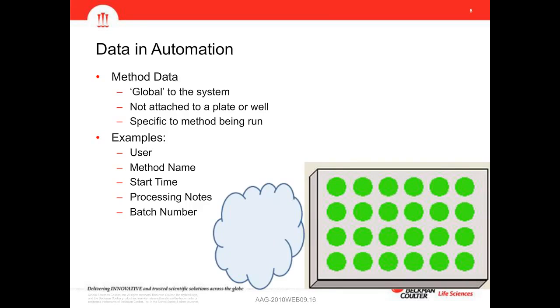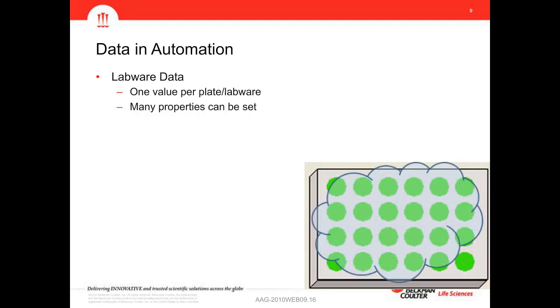And although this particular screen only had 12 total plates, you can imagine a much larger screen, such as one that would have 100 plates. You might want to process them in 10 batches of 10, so you could imagine something like a batch number, which would apply to all the plates that went through a given run.